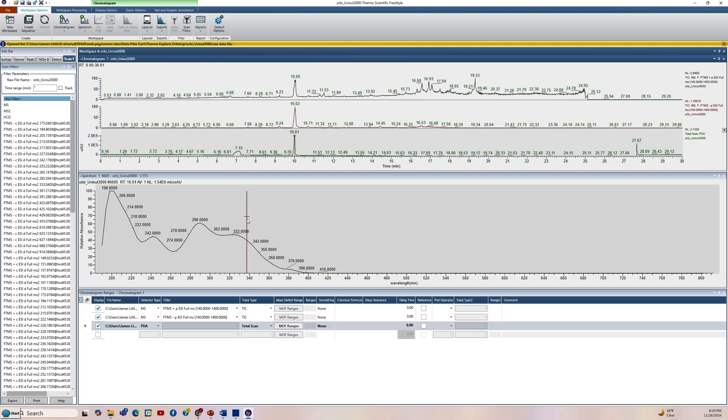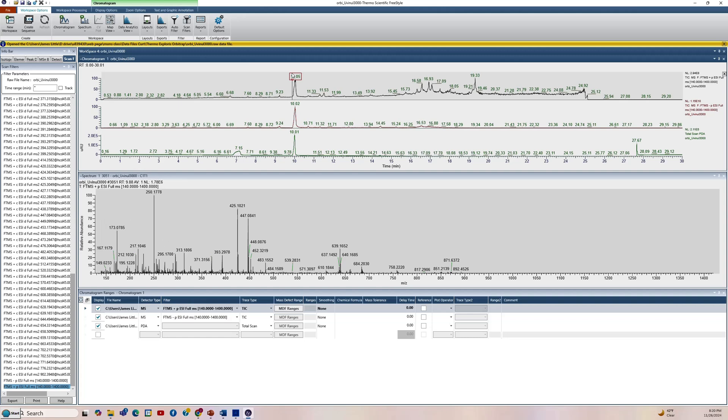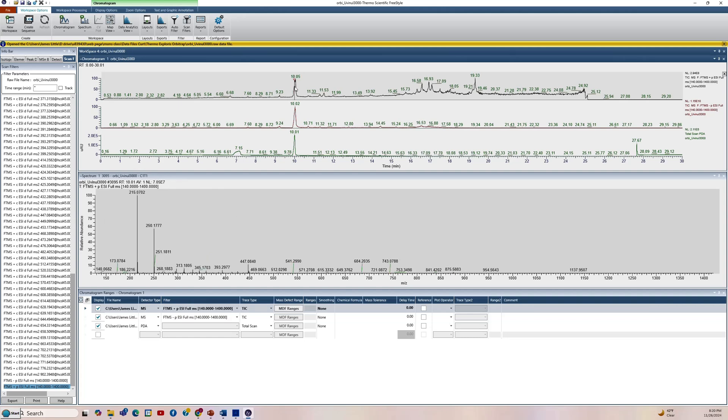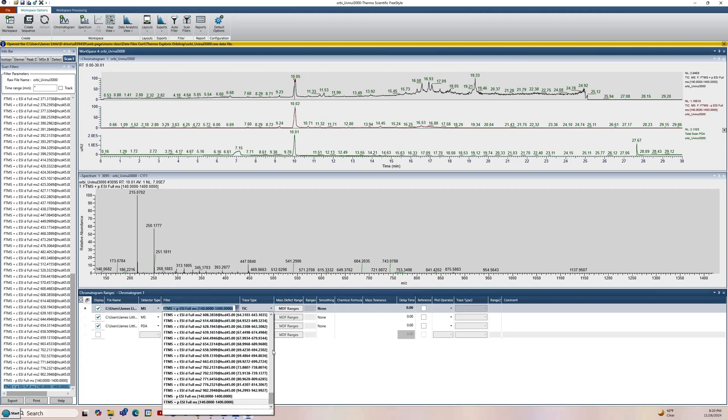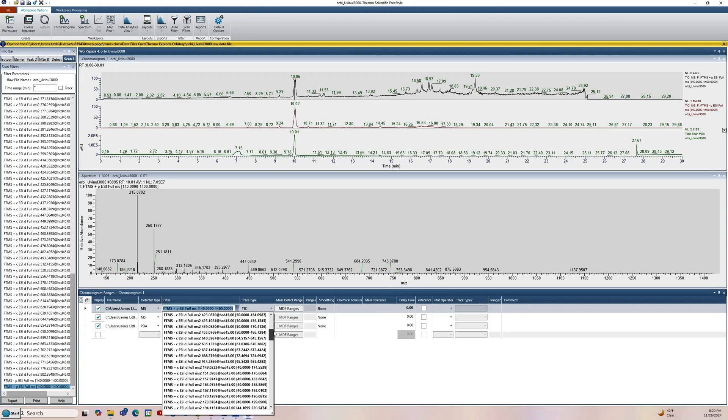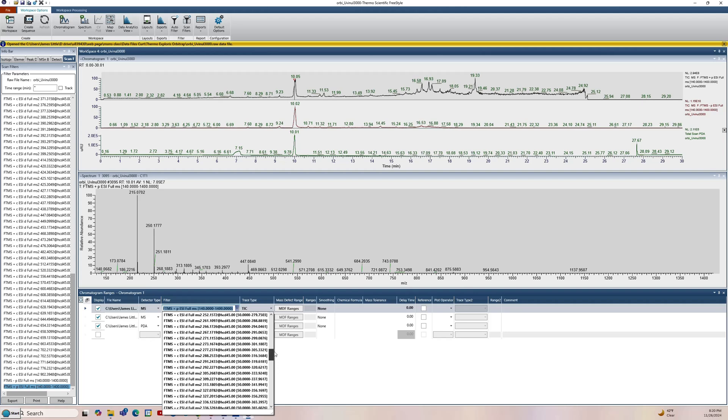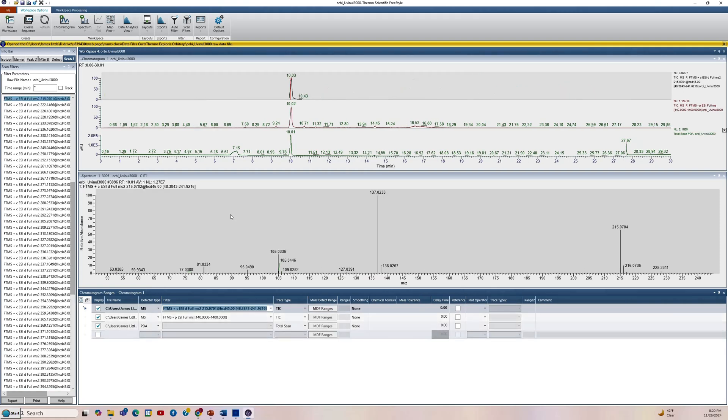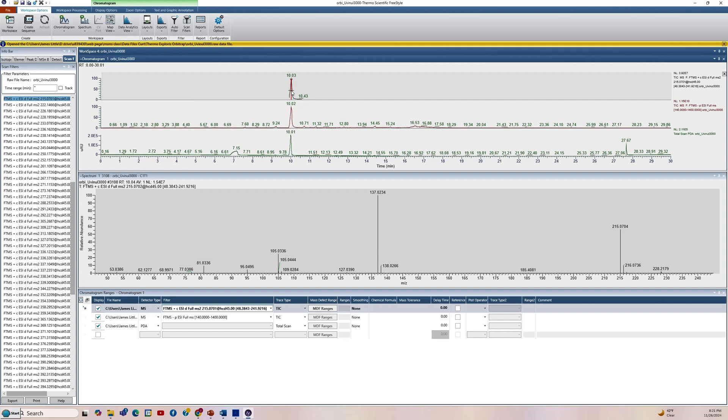So let's do the MS-MS. So if you go to the MS-MS, we need to go up to the top. We'll click on the positive ion here at the top. So let's click on it to get the spectrum. Now we'll come down to the bottom where it says filter here. And we'll go find the 215 ion, which is for the protonated species. So we're looking at the positive ion traces and we're scrolling until we see the 215 and we select it. Now we have the total ion chromatogram for the positive ion MS-MS. And again, like I said here, don't average these because when you send them to the NIST search, you will not get any accurate mass data to the right of the decimal. So just single left click on it and you can see we have a nice M plus H. Then we also see the fragment ions.